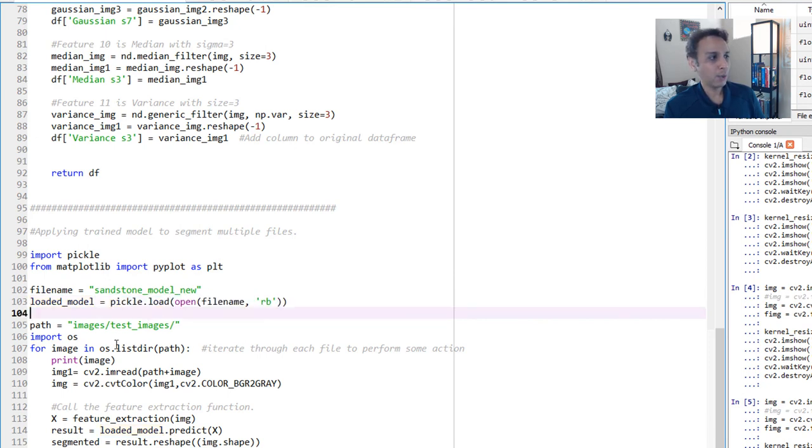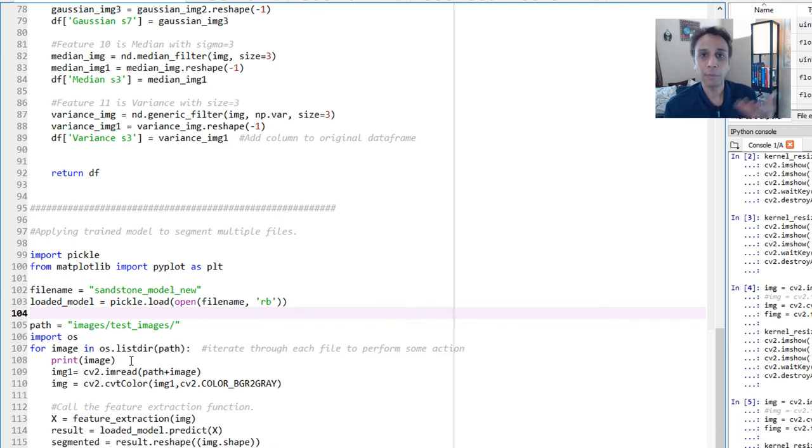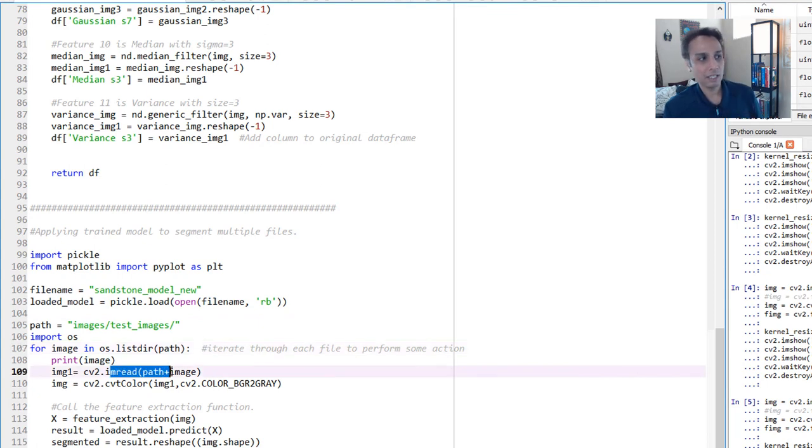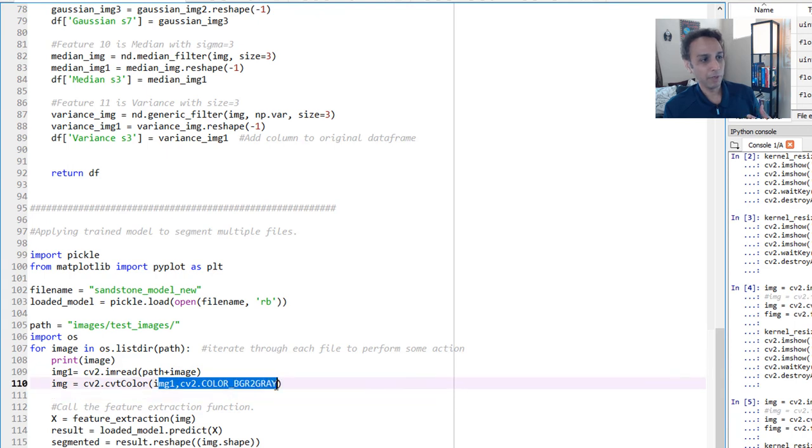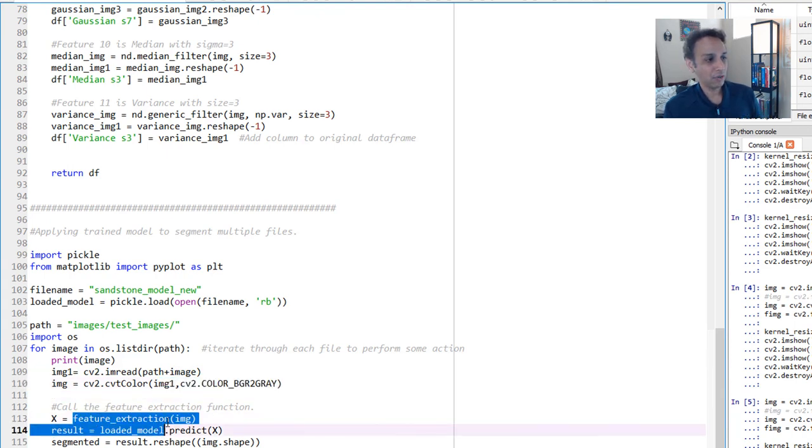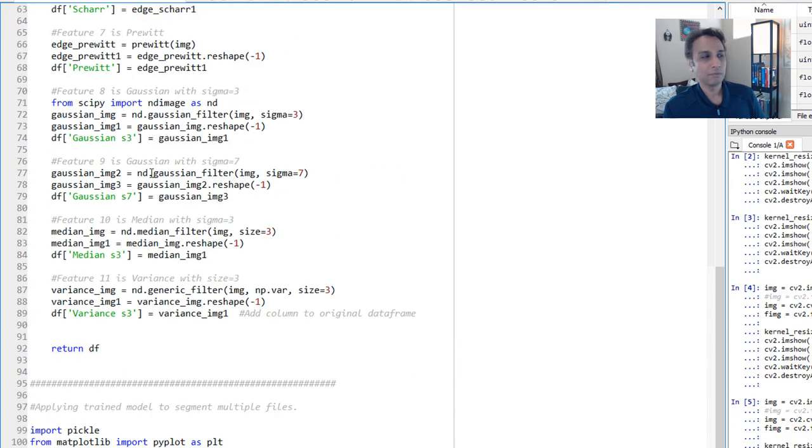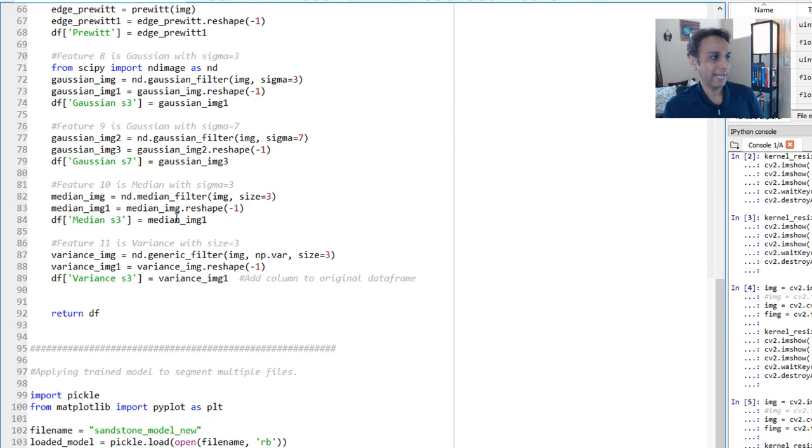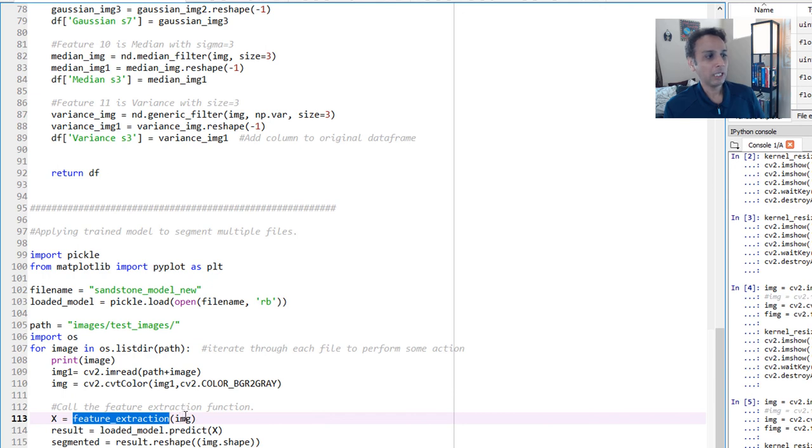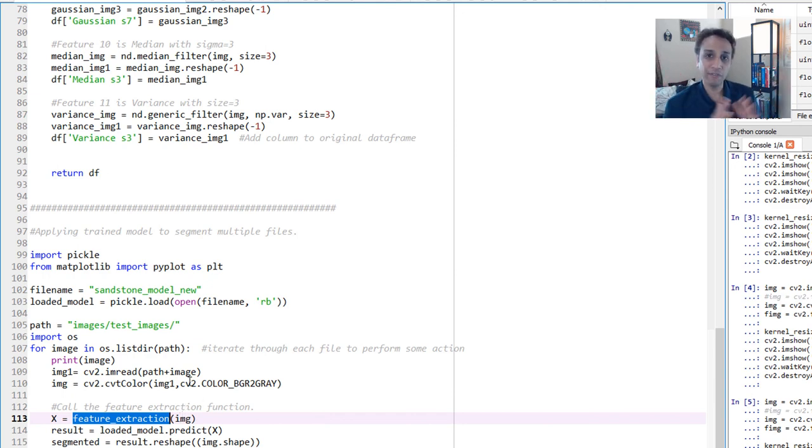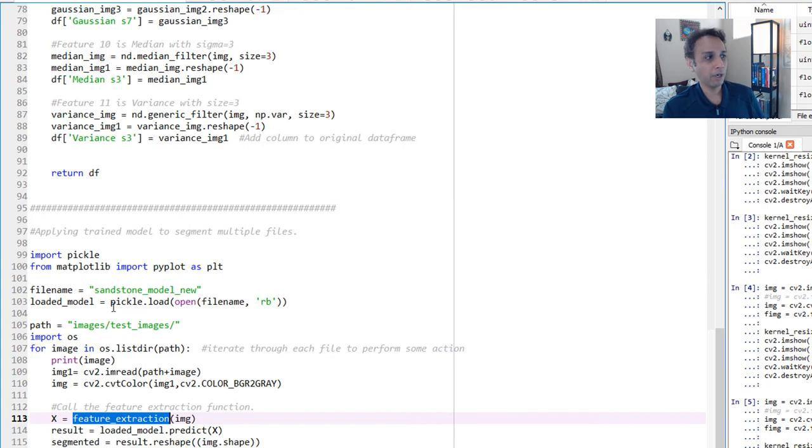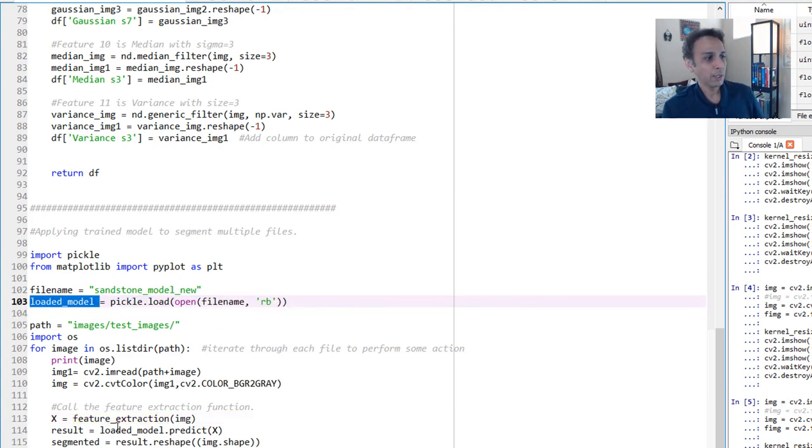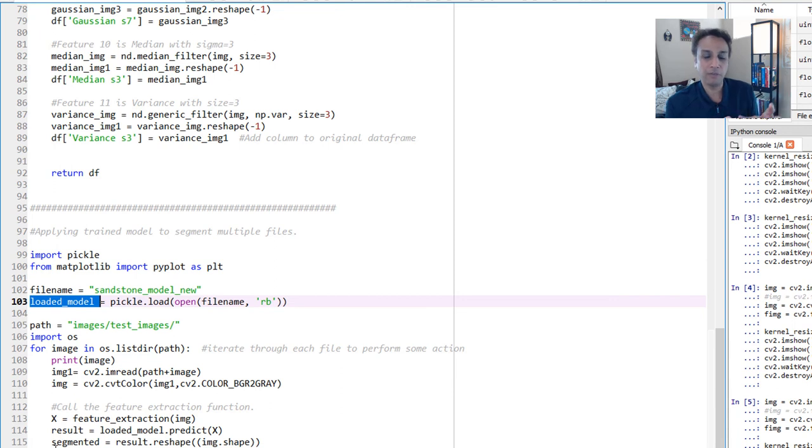Once the model is loaded, now I'm using my os.list directory again to go through each image that I want to segment. Again, now we are predicting. So I want a segment. So these are all test images, not train images. And I'm reading the images just like I did the last time. I'm converting them to gray just like the last time. And then applying feature extraction. Remember this function? This function that we just defined? Applying that right there. Meaning what gets returned is a data frame of all the features. Now we just apply our model.predict. Previously, we called it model. Now I'm calling it loaded model. So apply that onto your X and then reshape the result into original image shape because you want to convert that into an image and reshape it into your original image shape and save the image and save it to a folder.